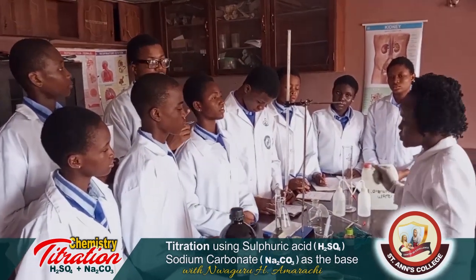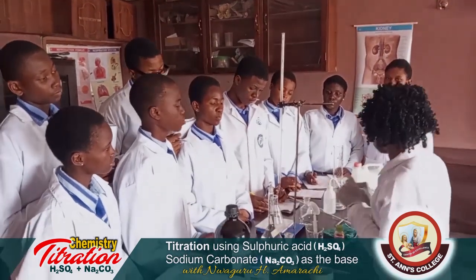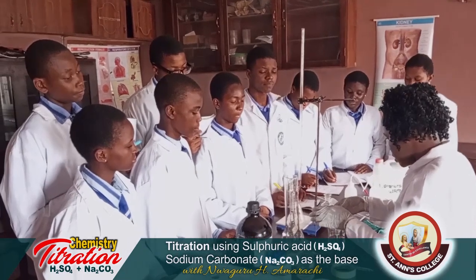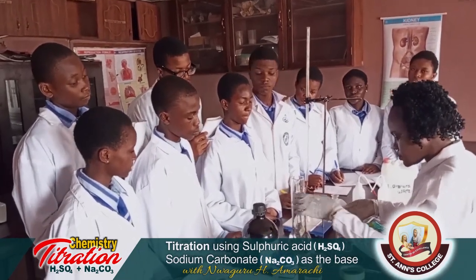Good. So now we have our measured acid. We want to make it up to mark in a 500 ml volumetric flask.